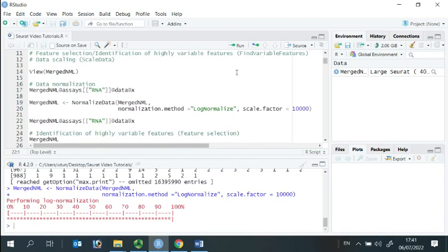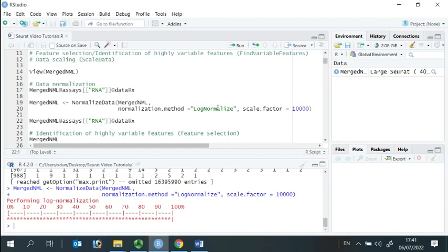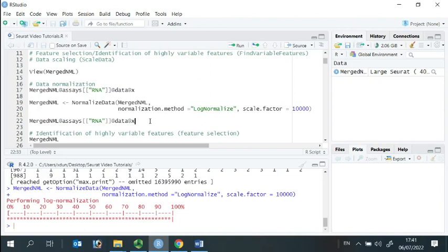Now we can run the function normalize data. By default, this function employs a global scaling normalization method called logNormalize. This method normalizes the gene expression measurement for each cell by the total expression, then multiplies by a scale factor 10,000, and then log-transforms the result.